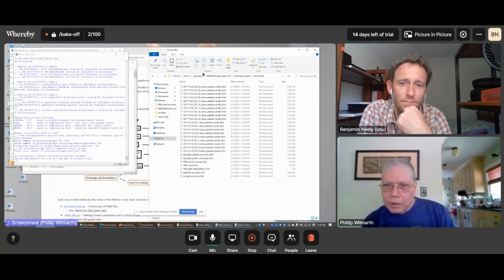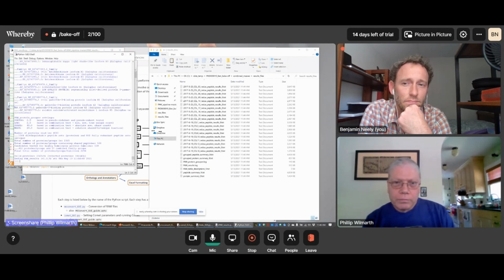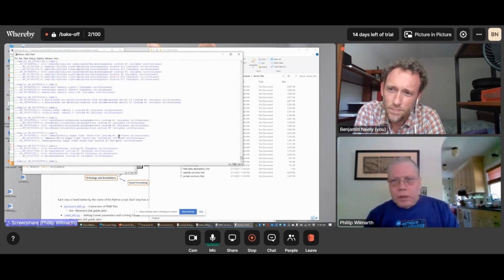So like I say, here we've got a detailed report for each of the 19 raw files. Then we've got our basic peptide and protein summary files that come from our first basic parsimony analysis. And then here, let me go over and look at this. We run an additional grouping step that's kind of interesting and a little bit different.